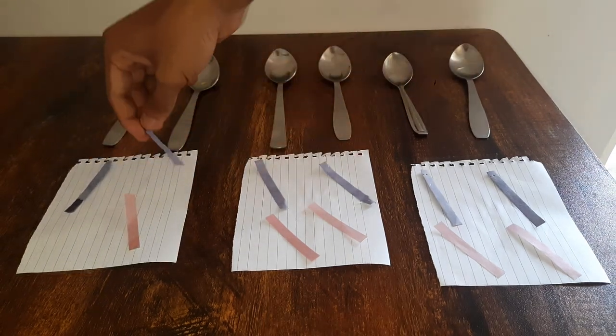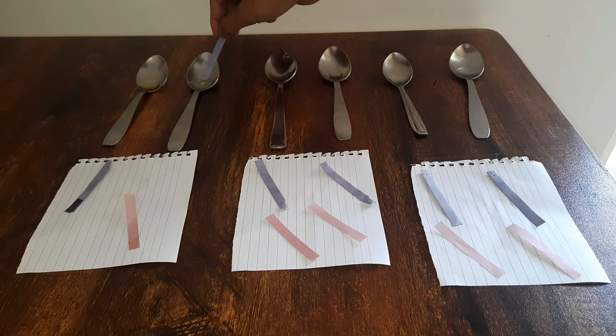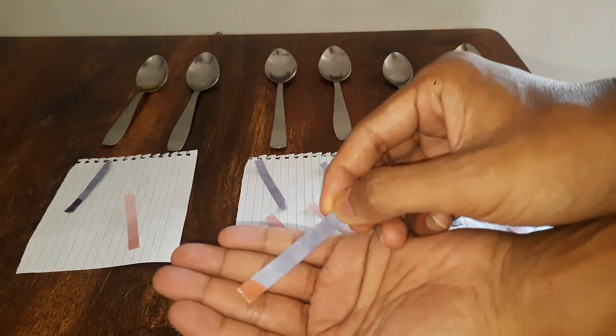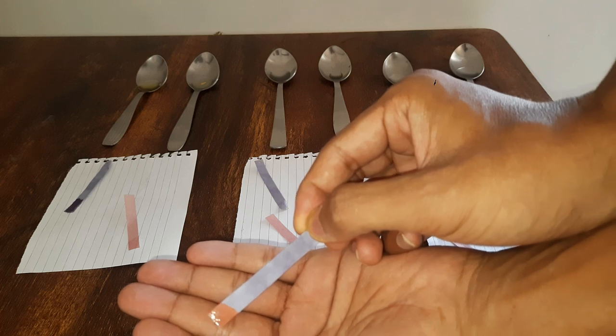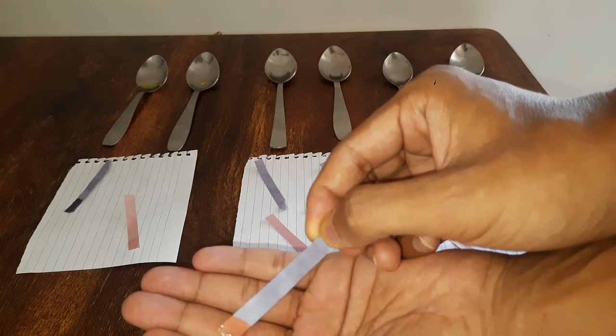Let's see what happens when we take the blue litmus paper. The blue litmus paper turned red, which tells us that lemon juice is slightly acidic. It is acidic in nature.